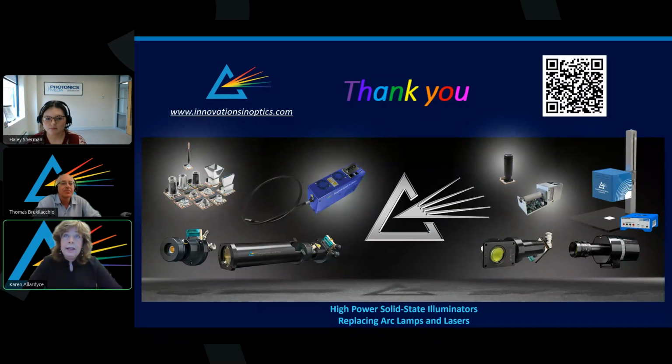And as the LED die count increases, maintaining spectral balance becomes more difficult. It's a significant system level engineering challenge. It becomes even greater over the lifetime, which is a huge consideration, right? Different wavelengths age at different rates, and they degrade differently with use.